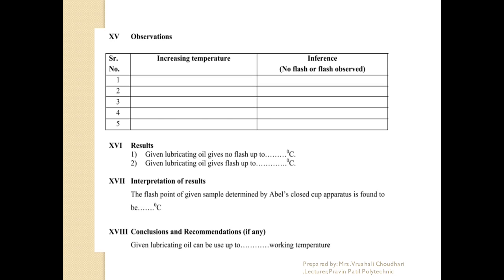What is the meaning of flash? It is a spark. At home, when you use a lighter to turn on the gas, it is a very 1 second flame, that is called a flash. But if we use a matchstick for lighting, it gives you a continuous flame.